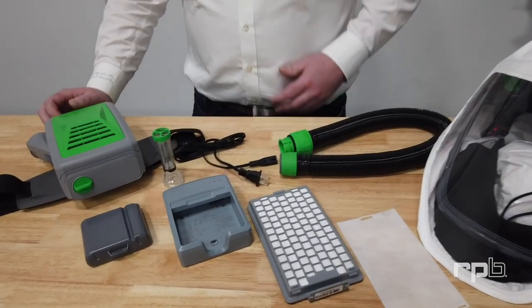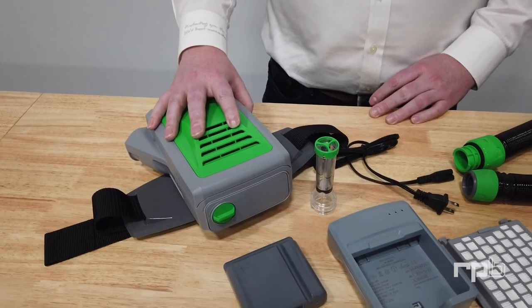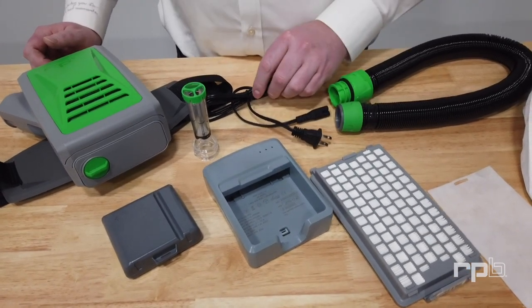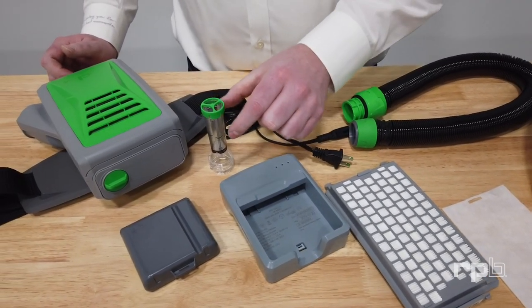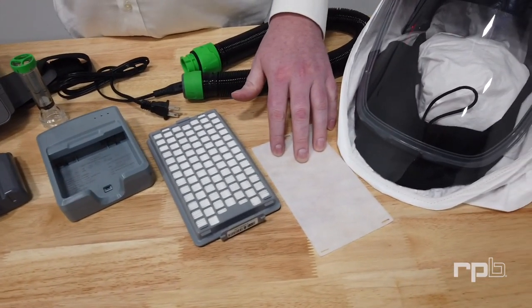In the kit you would have received a PAPR, a battery, a charger, the cable for the charger, a flow meter, a HEPA filter, and also a pre-filter.